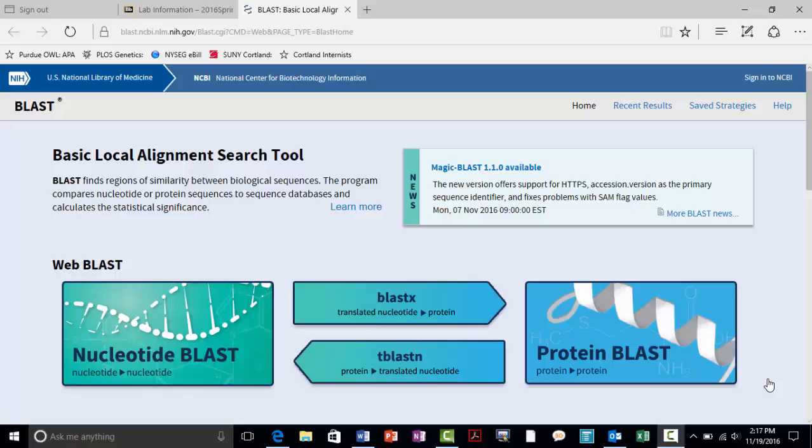We're going to be using a website that is a branch of the NIH called the National Center for Biotechnology Information, or NCBI. NCBI is where the database called GenBank is housed. GenBank is a huge database of DNA, RNA, and protein sequences that is available to the public for uses such as ours. All published research that includes these kinds of sequences are required to be uploaded to the GenBank, so this database is growing on a daily basis.